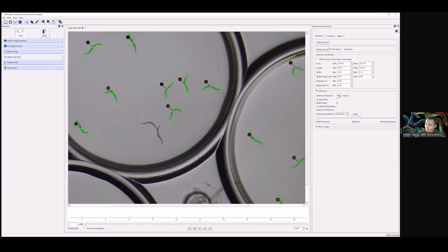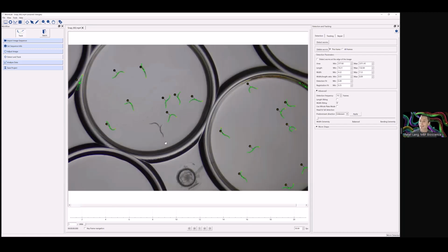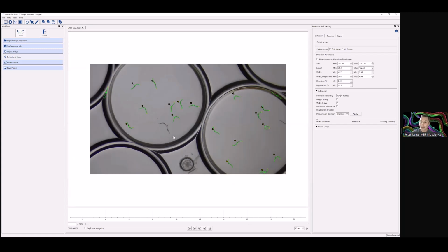So just a point there, do not click on compound type objects when setting up your detection parameters, because it will effectively corrupt them. But getting back to my point here, we want to eliminate some of the areas that we don't necessarily want to track within. And the way we can do that is by using this feature that we have.